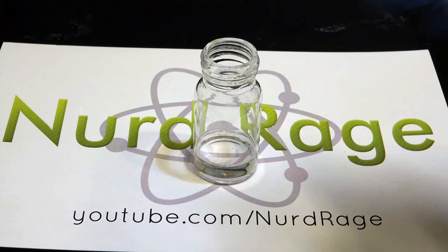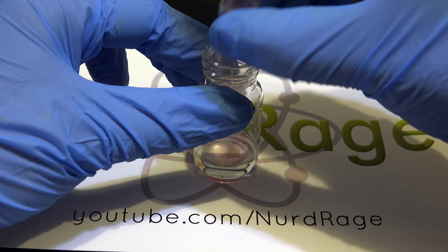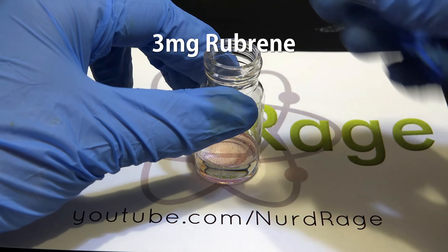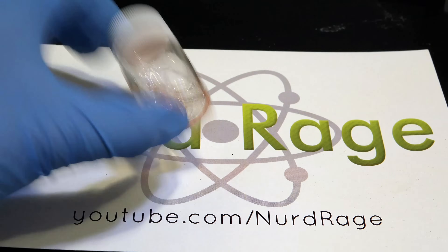First we're going to start with our solvent — around 3mL of dimethyl phthalate. Now we add in a fluorescent dye. I'm using 3mg of rubrine, which will give us a yellow color. You can also use 9,10-bis(phenylethynyl)anthracene for a green color or 9,10-diphenylanthracene for blue.